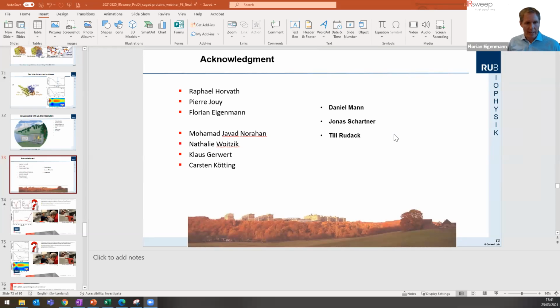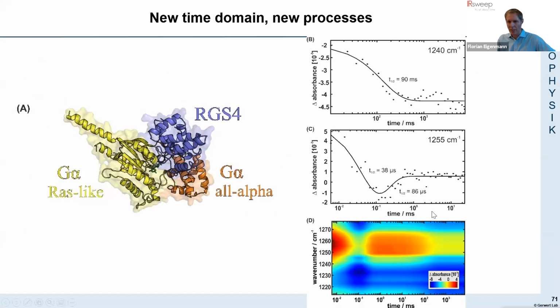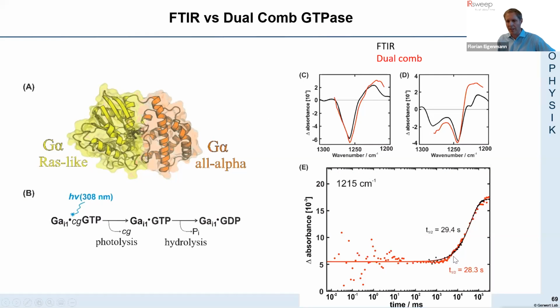You showed really nicely some data on microsecond resolution, Carsten. My question is where you compared some data with FTIR, and you mentioned the first point was at 50 or 60. Yeah, I showed in the first slide 10 milliseconds. In 10 milliseconds, you get an interferogram.